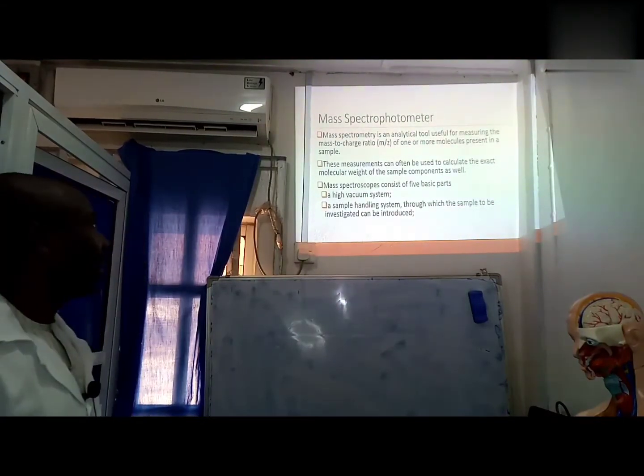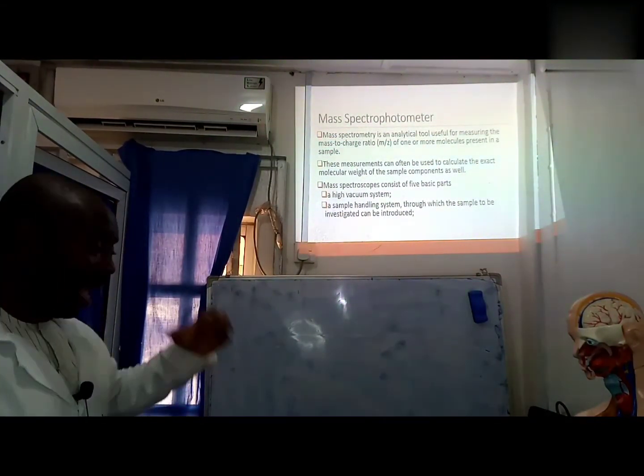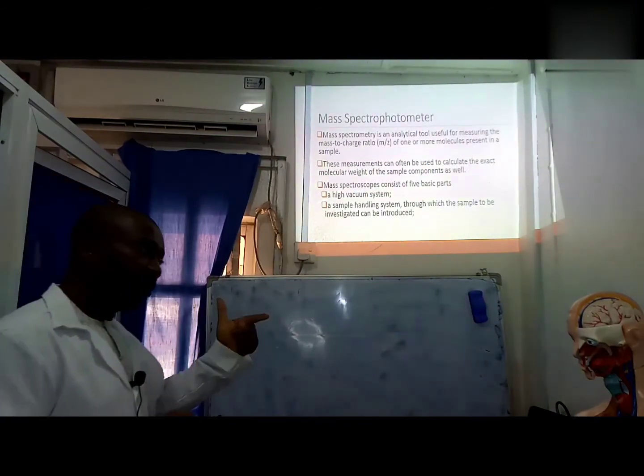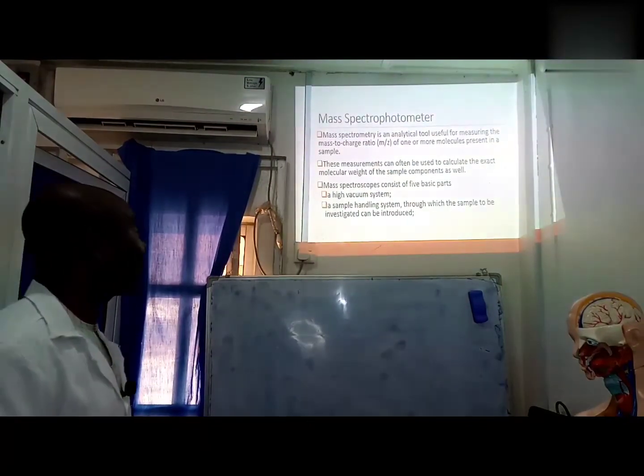Mass spec can help us, through its concept of mass to charge ratio, detect and bring out what kind of contaminants we have in the water we are analyzing.